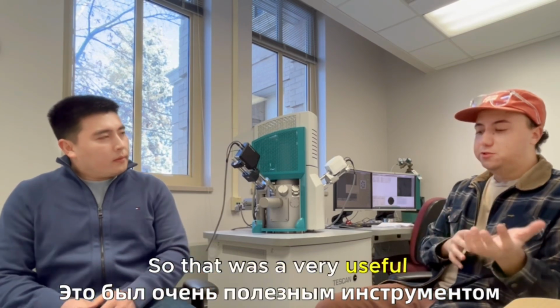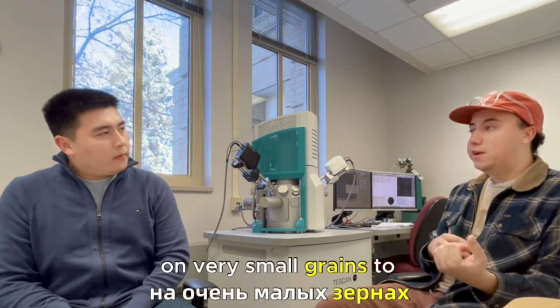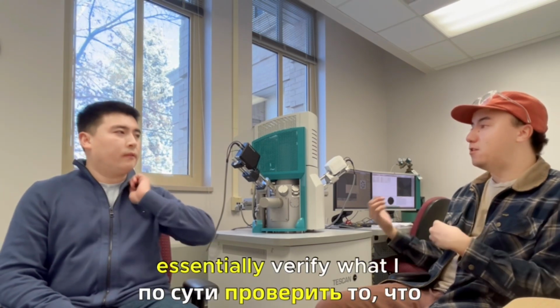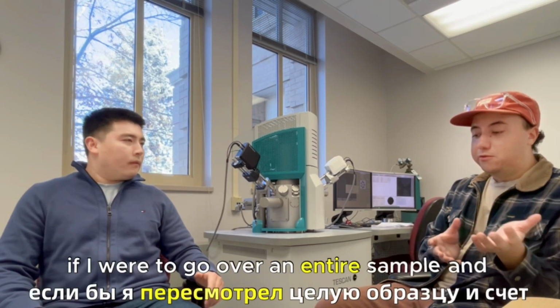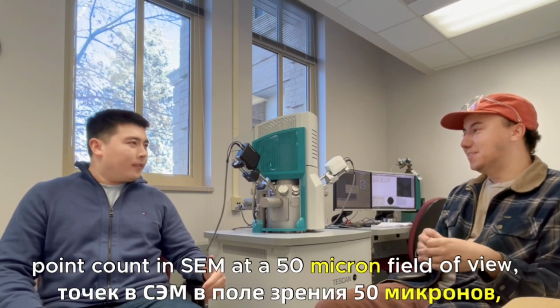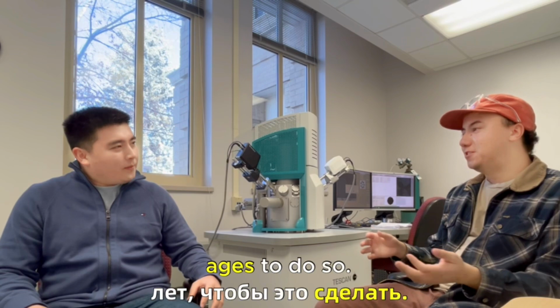So that was a very useful tool for imaging very small grains, for doing point analyses on very small grains, to essentially verify what I was seeing by automated mineralogy. But again, if I were to go over an entire sample and point count in SEM at a 50 micron field of view, it would take me ages to do so, right?